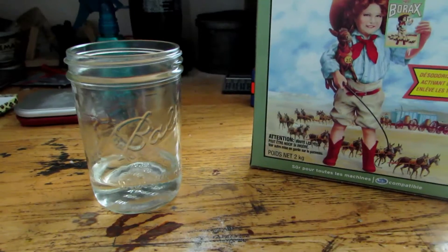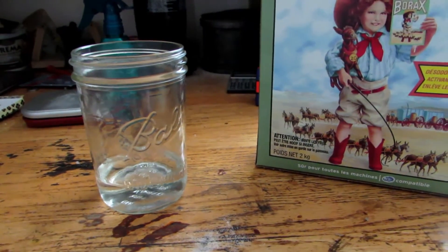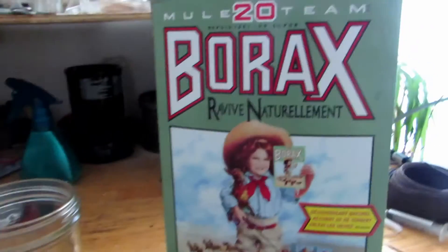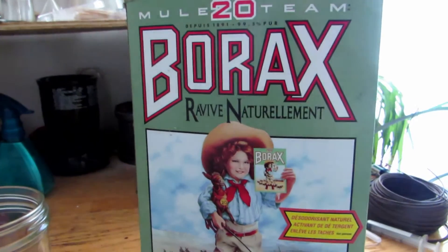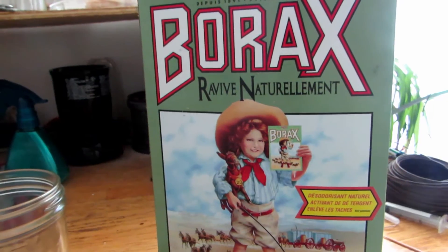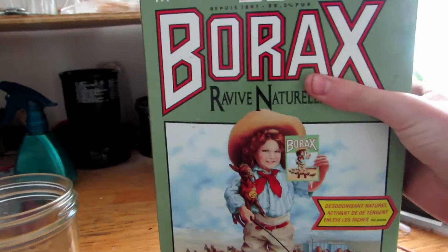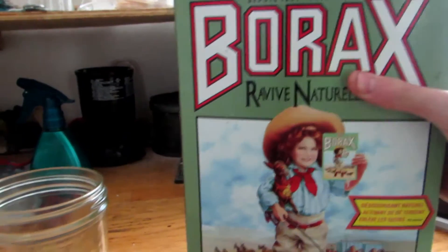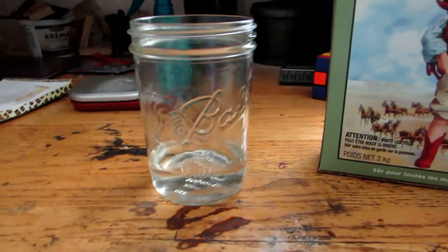Hey guys and welcome back to how to make elements from household materials. Today's element is going to be boron. Borax is a compound of boron which you can commonly buy at a store. The compound here is sodium tetraborate, which we're going to be turning into elemental boron.